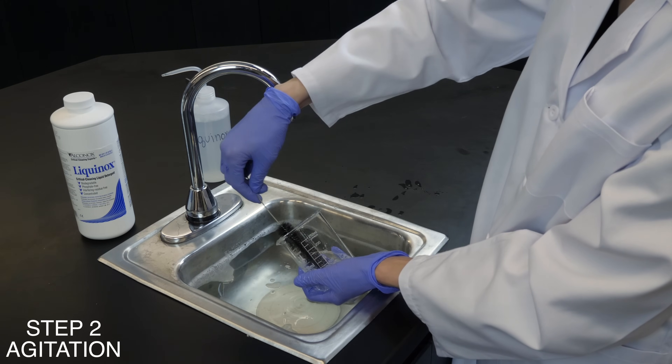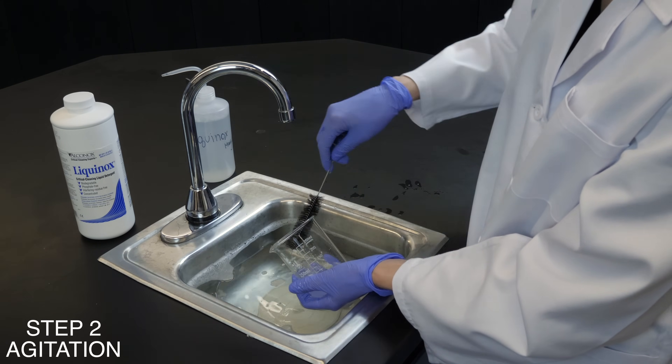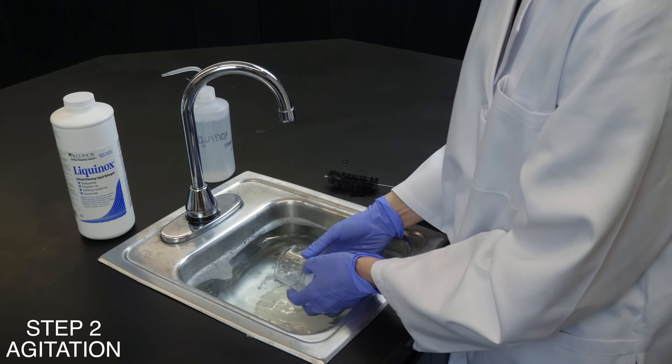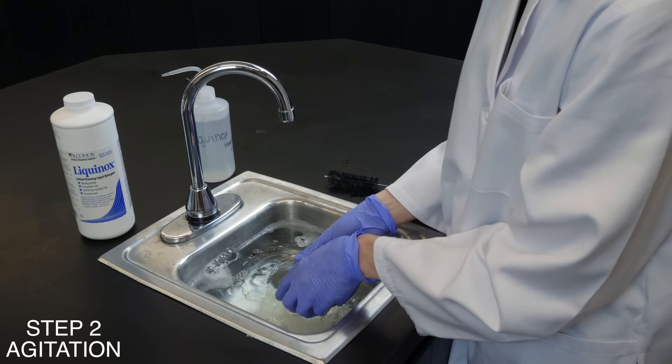For difficult residues, use a scrub brush, ultrasonic cleaning, or flowing solution. You can clean with the same type of dilute solution used in pre-soak, or apply detergent to dirty glassware and add water and scrub.